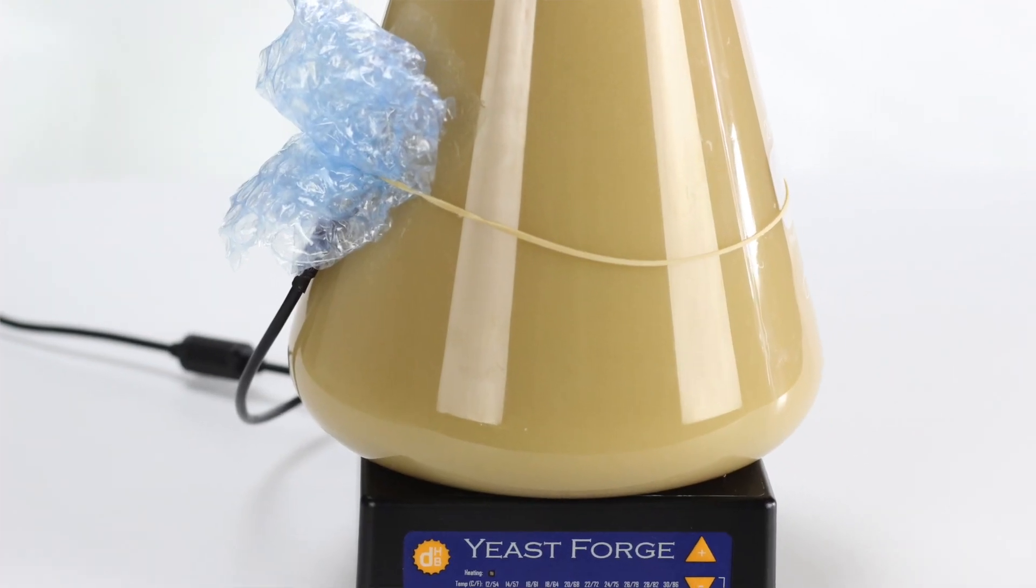And by putting the temperature probe underneath that bubble wrap, that's going to protect it from the ambient air temperature here. So if the air is really cold here, it's not going to affect our readings and mess up the readings for the starter temperature.